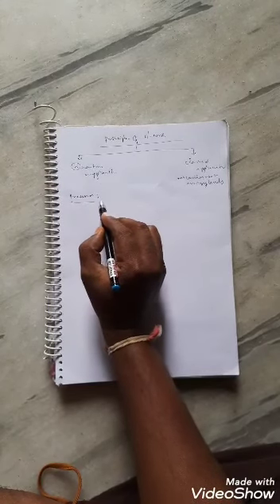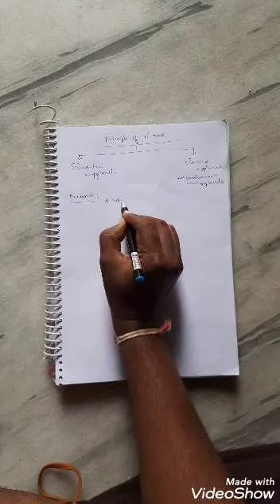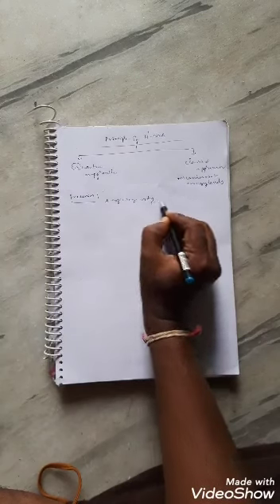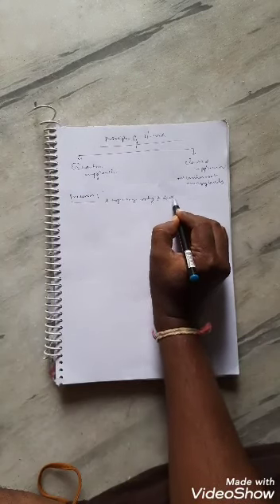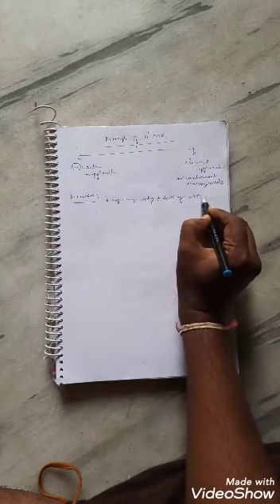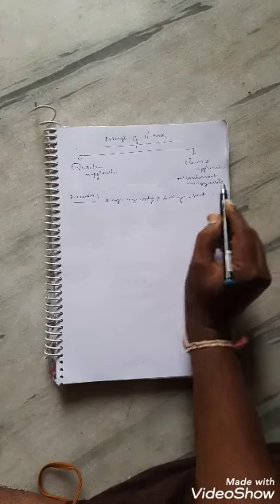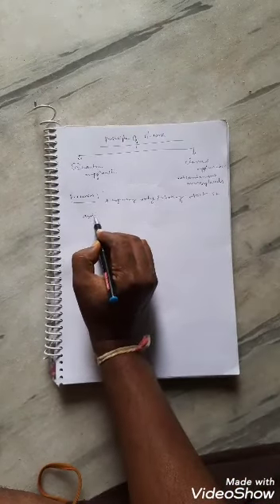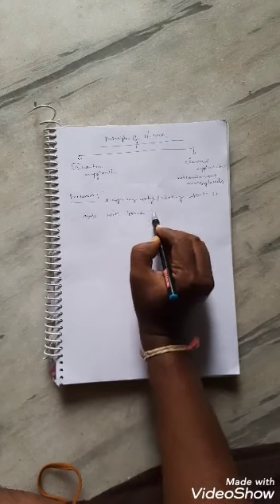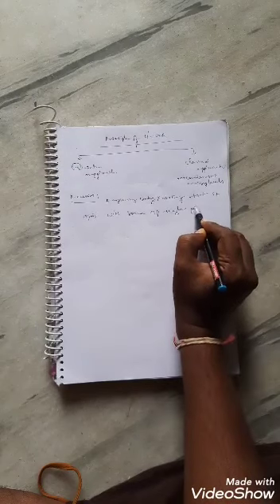You can define precession as a spinning body rotating about its axis with some tip angle. The tip angle is called the precession movement.